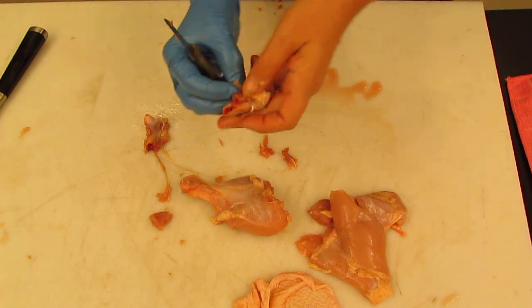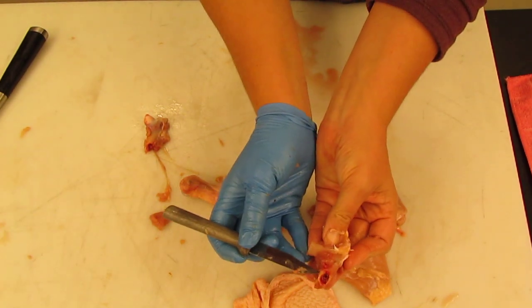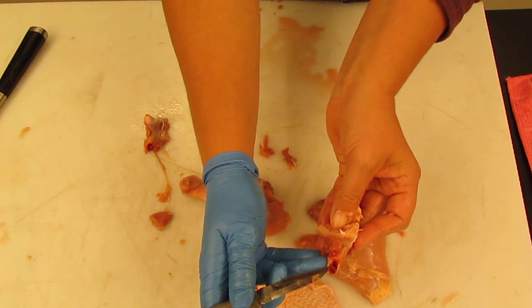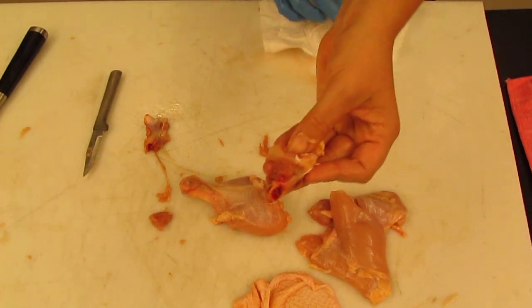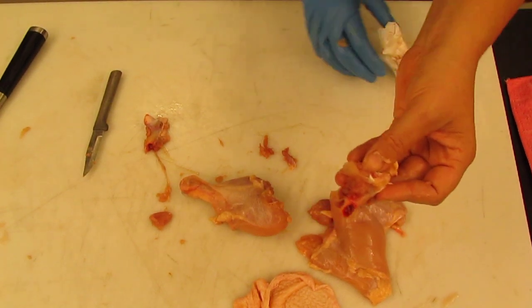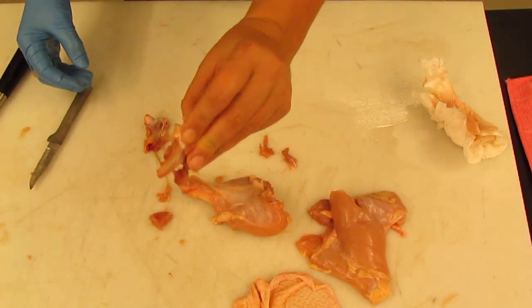Okay, so inside the bone, we can see a shell of compact bone, a tiny little bit of gritty, spongy bone, and this red chunky stuff here, this is the red bone marrow. That's really what I'd like you to see. Inside the bone, compact bone, kind of gritty, chunky, spongy bone lining the medullary cavity, and red bone marrow inside the medullary cavity. Now keep in mind that chickens at this point only grow for like 7 to 8 weeks, so this bird was still very much growing when it was processed, and that's why the medullary cavity has red marrow instead of yellow bone marrow like an adult.